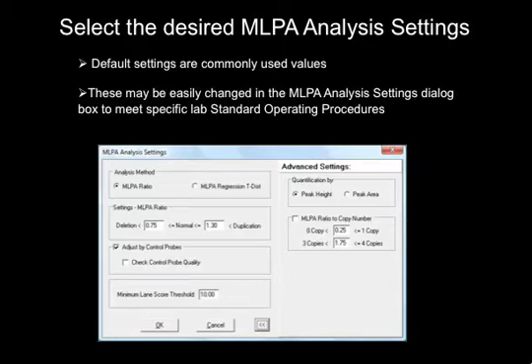Radio buttons and checks are used to select analysis method, adjust by control probe, and quantification options. MLPA ratio on the left side of the dialog box and MLPA ratio to copy number on the right side of the dialog box may be customized by typing in the values.